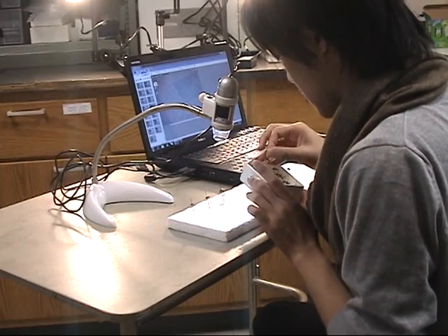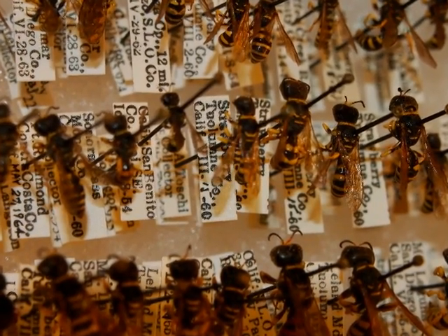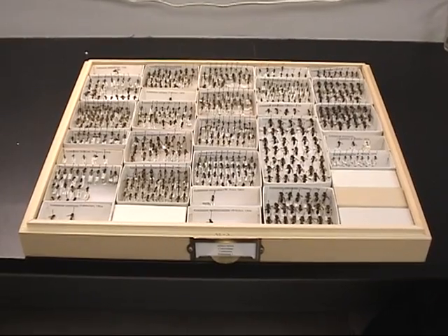Place specimens carefully back into the tray and drawer that you took them from. Specimens should be oriented so that the heads are all pointing to the top of the drawer and should be placed in rows from left to right.